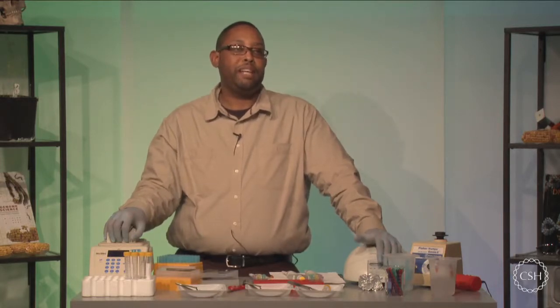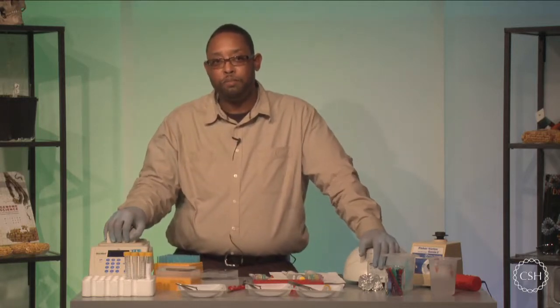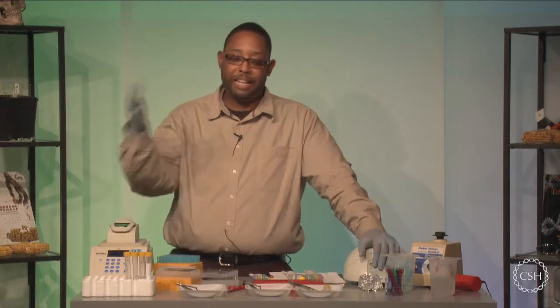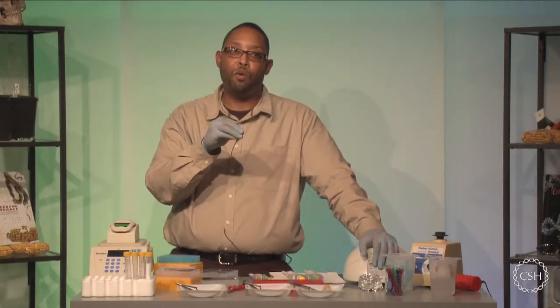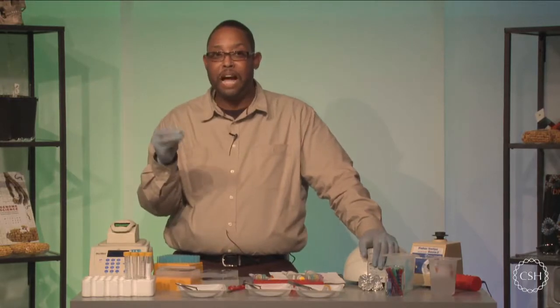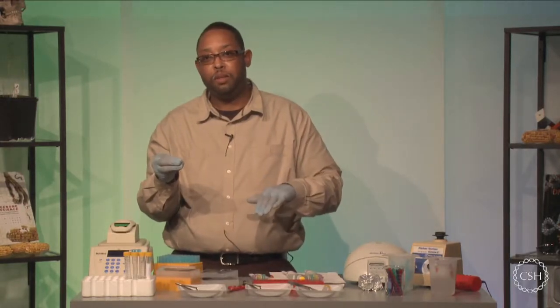So the question we have is, why did the silica separate from the DNA in distilled water with centrifugation so easily? So the silica resin actually isn't soluble in water. The only thing that is soluble is the DNA. And the idea is that when we're in the lysis solution, the lysis solution actually cross bridges the DNA to the silica resin. And in the presence of water, we lose that cross bridge and the DNA releases. Since DNA is very soluble in water, it dissolves, but the silica resin is not. So we can actually sediment the silica resin back down to the test tube.